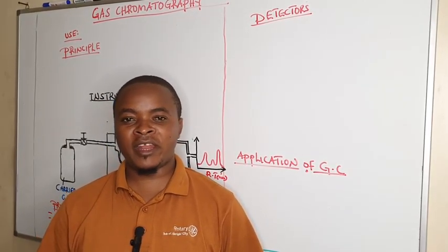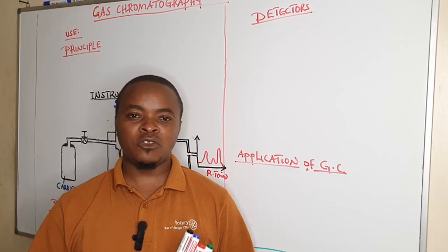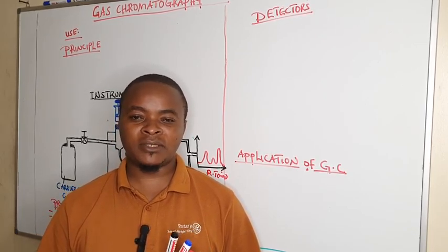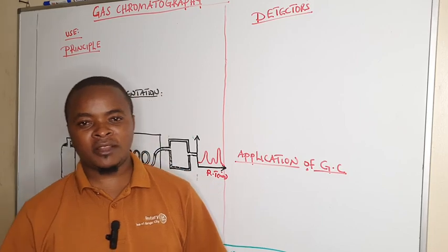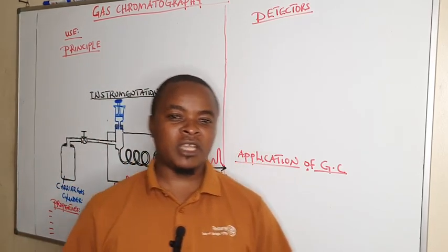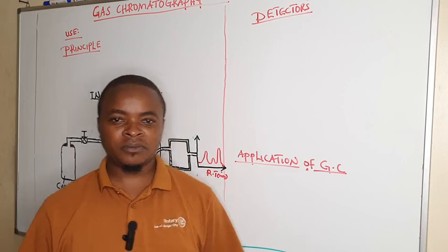In this session, we are diving into gas chromatography, where we are going to look at the definition, its purpose, the principle, instrumentation, and then application of this gas chromatography. Previously, we have looked at the calculations and HPLC.